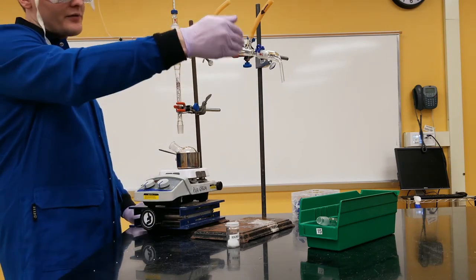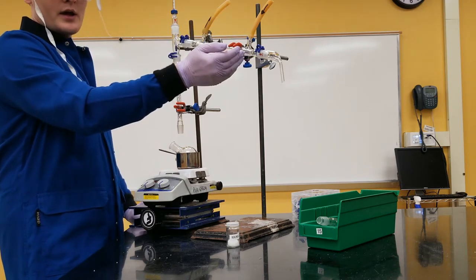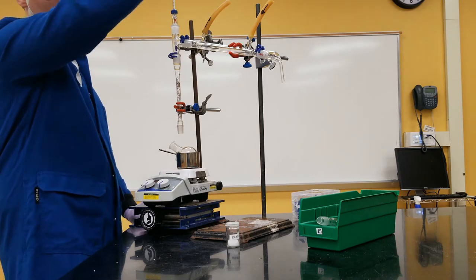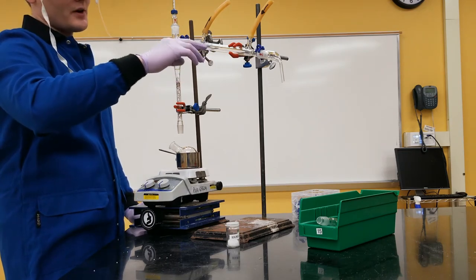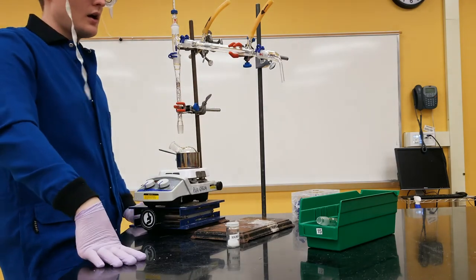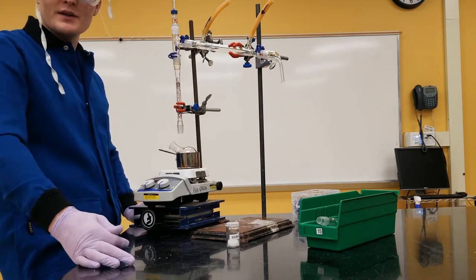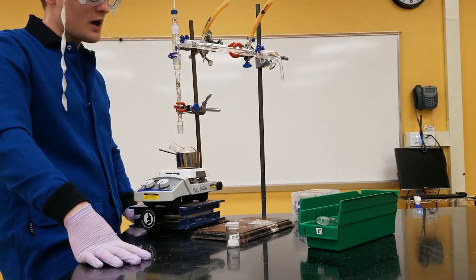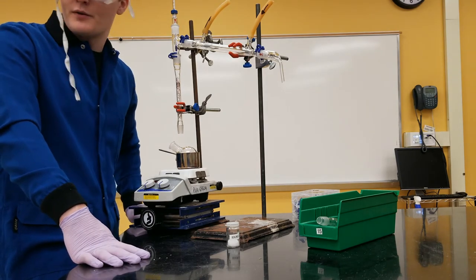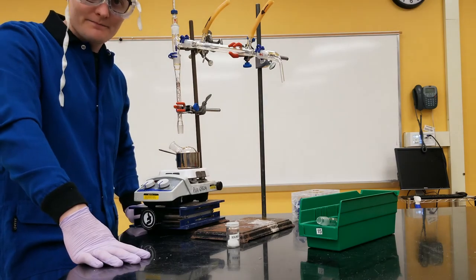So yeah, we're filling from the bottom. The water's going to fill up this whole volume. It's going to cool down the tube in the middle here, and then the water is going to run out the top, and the drips of solvent that we're collecting are going to run out this way. So I think that's most of what I want to talk about for the distillation setup now. We're going to go ahead and probably just transfer this one over to the hood and get it running so that you guys can see what that looks like.